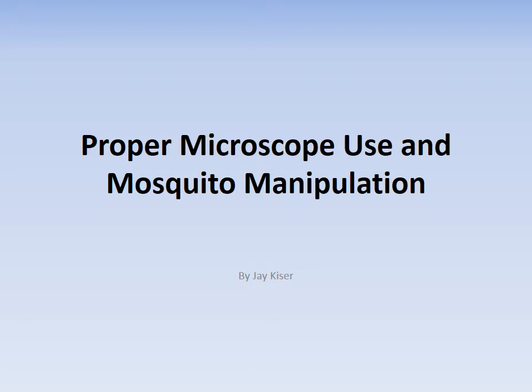And then next, with the dichotomous key, I highly suggest talking with your biologist and having a mosquito sample in front of you, preferably the one that I'm using, and then we'll go through the key step by step in how to ID it.